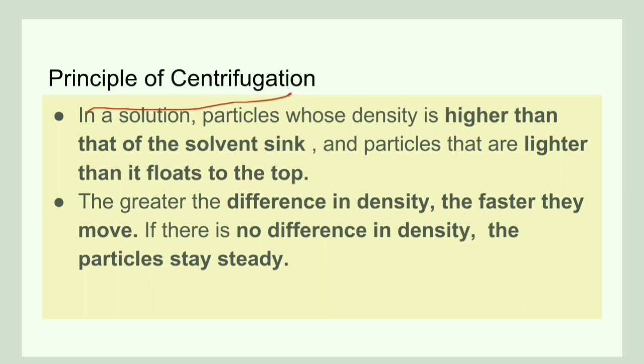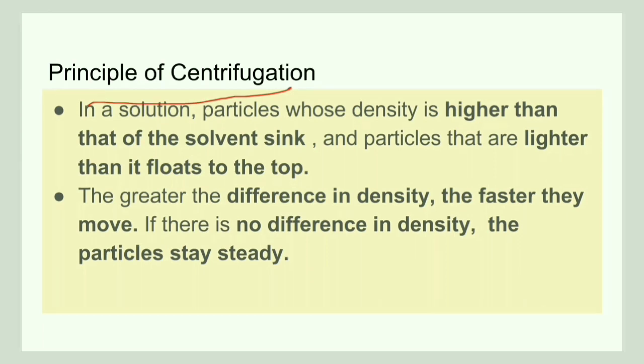If there is a greater difference in density, then they move faster. If there is no difference in density, then the particles stay steady. So the principle of centrifugation is that higher density sinks while lighter density floats.